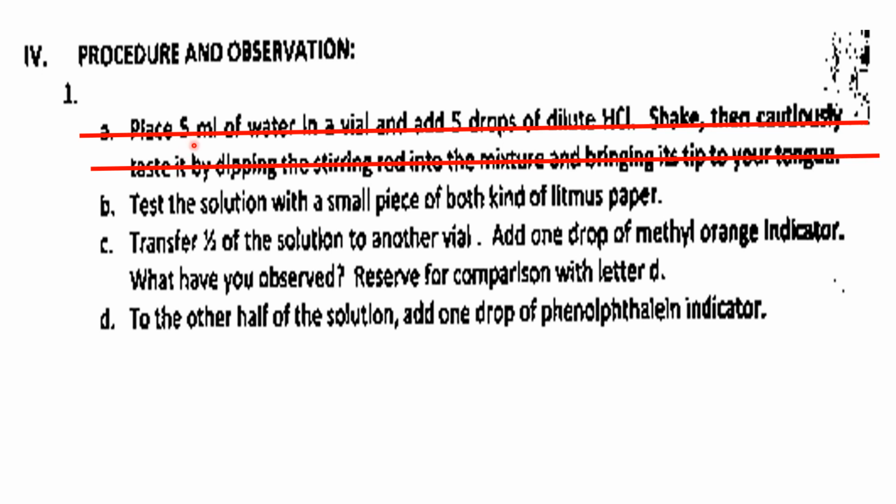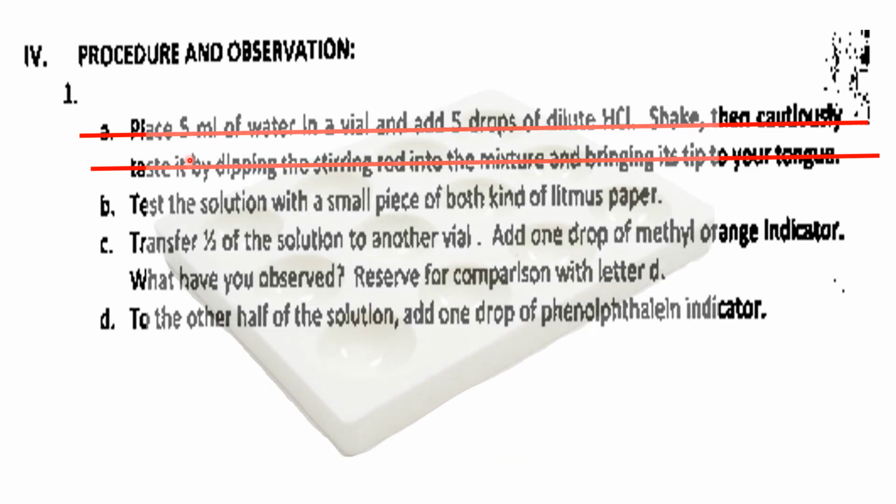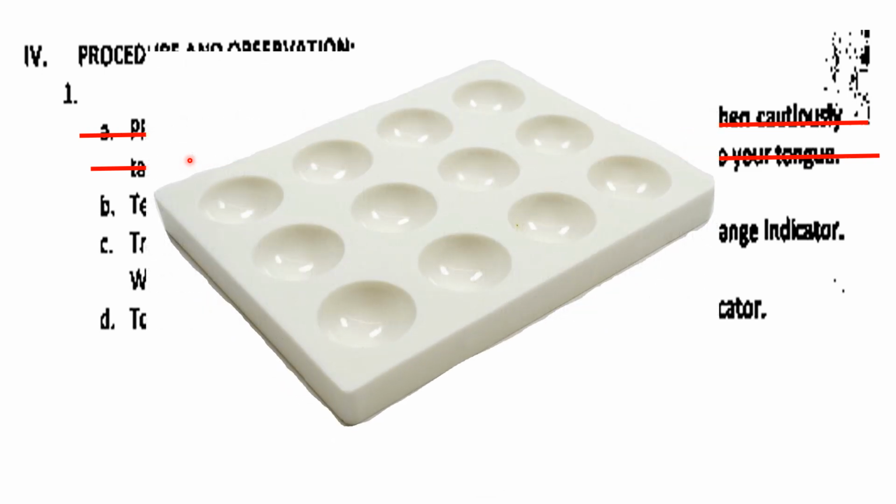Instead of 5 ml water, we will be using a smaller amount because we will make use of this apparatus. This is called the spot plate. A spot plate, also called a reaction plate, is a laboratory tool made either from ceramics or plastic. Each plate consists of many cavity-like depressions in which only a small amount of reactants can be added at a time.